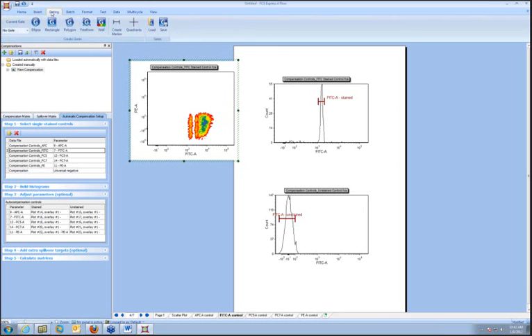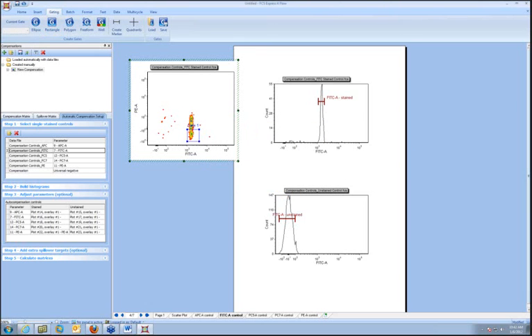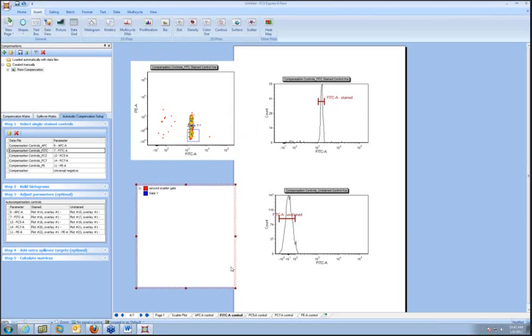So of course, what we are using by default by using the marker gate is the entire population here, but say I only want to use this bottom part. Well, all you have to do is make sure that the gate that you made, this new gate 1, is in the correct position in the hierarchy. So I'm going to put it as a child of the scatter gate. And then I can just drag this gate 1 onto my FITC stained control cell over here. You should be able to see that I'm now holding the mouse over the FITC stained control. It's currently coming from plot 16 overlay 1. As soon as I let go of the mouse, it now changed to plot 26 gate 1.